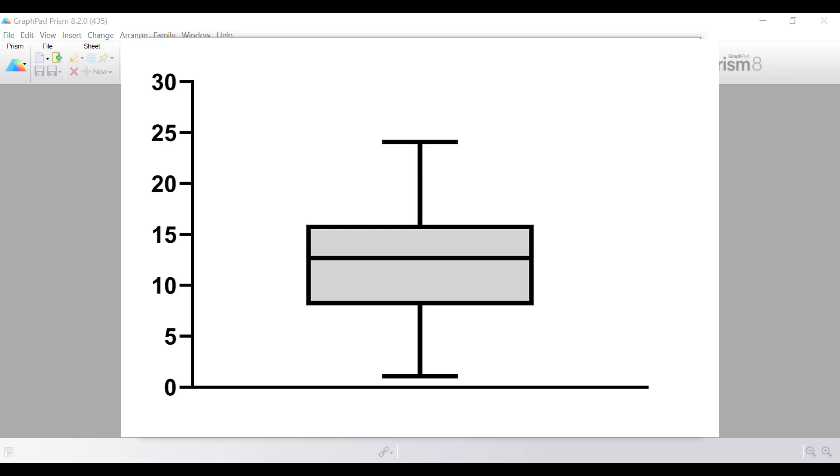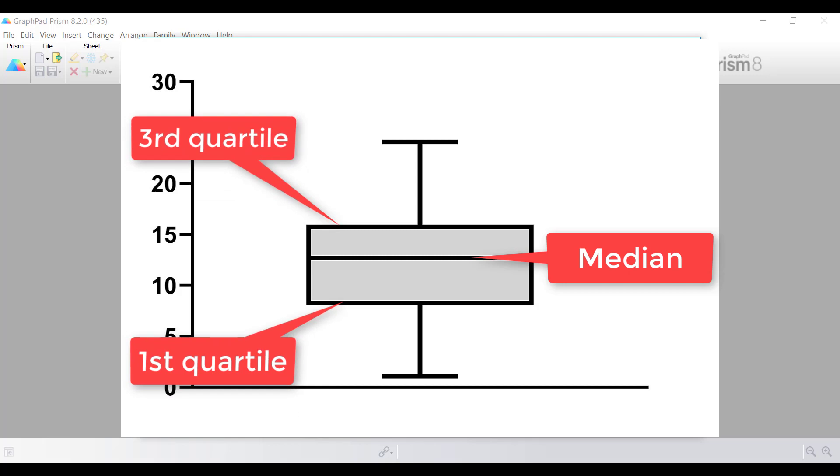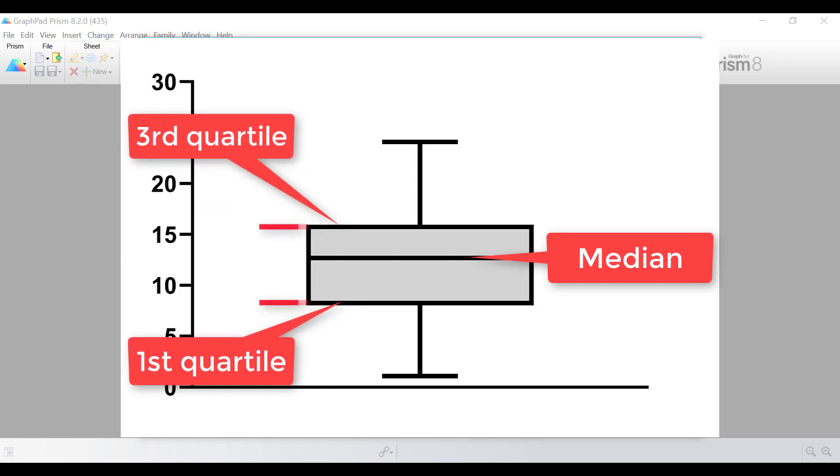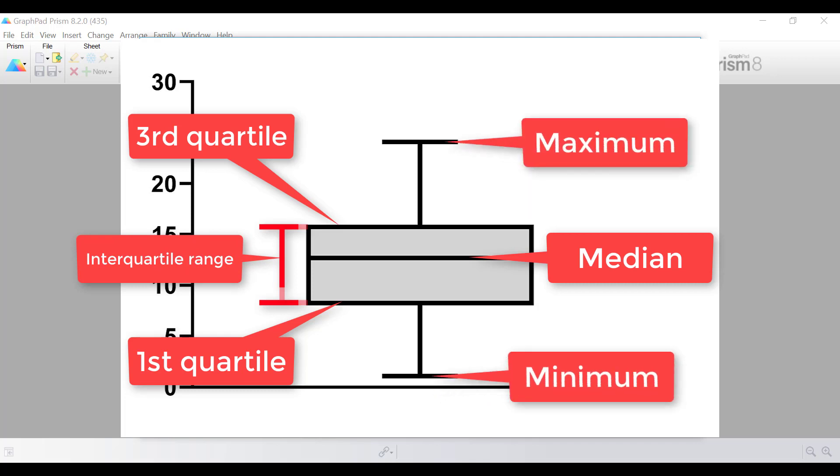An example of a box and whisker plot can be shown on screen. On the plot there are five summaries of data. Firstly, the line inside the box indicates the median value. The bottom and top of the boxes represent the first and third quartiles. The distance in between these, the third minus the first quartile, is known as the interquartile range. Finally, the whiskers usually, but not always, indicate the minimum and maximum values.